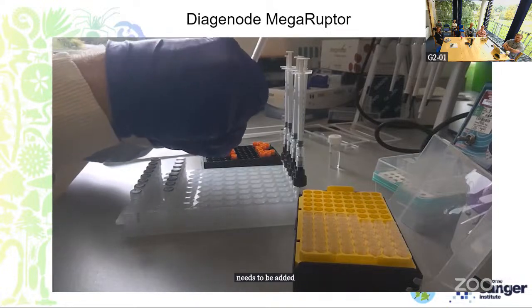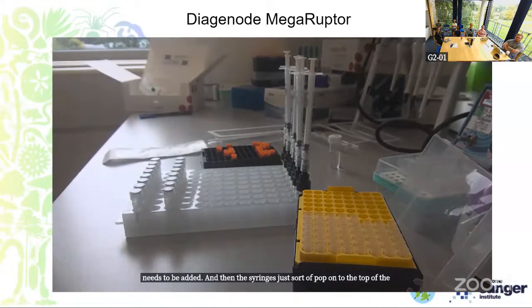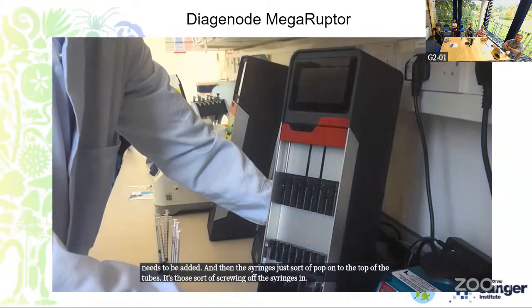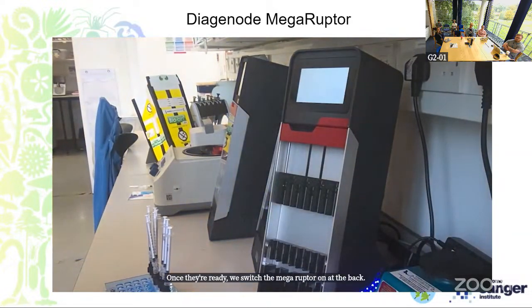And then the syringes just pop on to the top of the tubes. There's no screwing the syringes in. Once they're ready, we switch the Megaruptor on at the back and remove the cassette so that the instrument can be initialized.